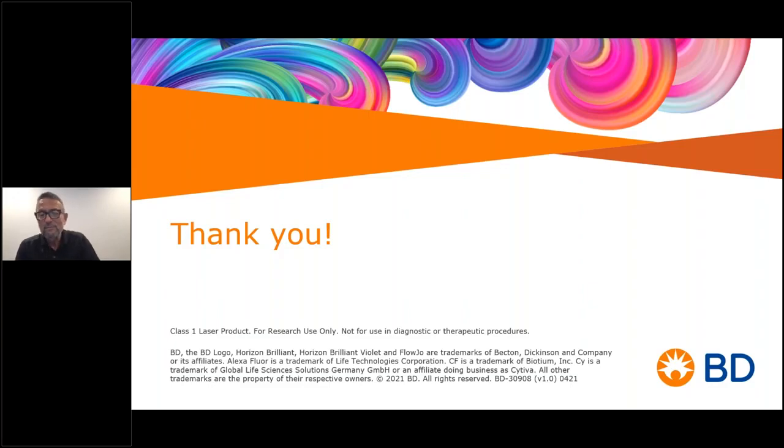And that's why I wanted to make the point that these two tools are not, I'm not saying SSM is not useful anymore. They're complementary, they have different values, and they can be used together to control your experiment.